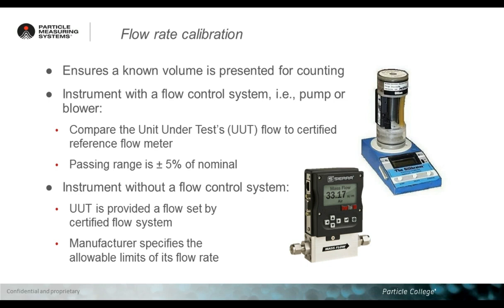If you look at the GMP Annex 1 table or the ISO 14644-1 table, you will always see the maximum permitted particle number in a volume of air, which is normally 1 cubic meter. So you can easily understand that an accuracy in the volume sampling is extremely important.